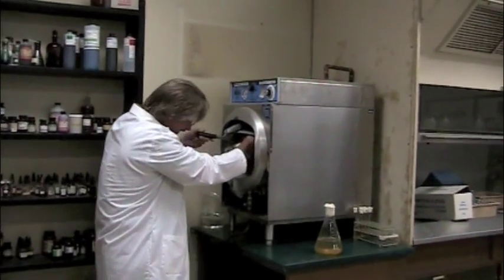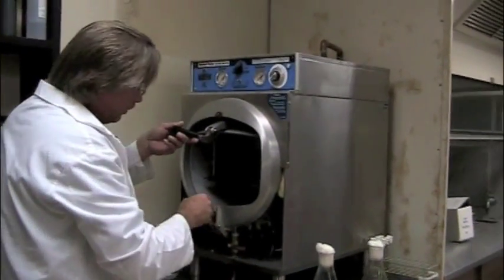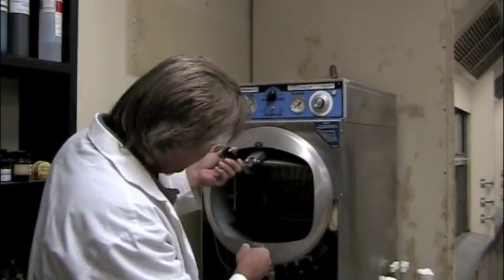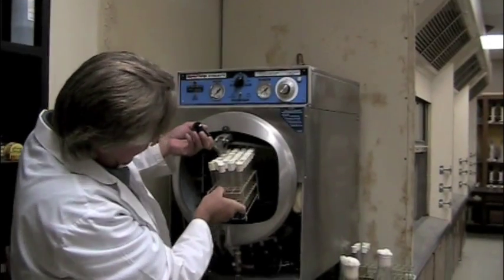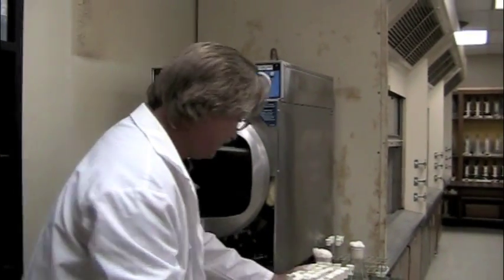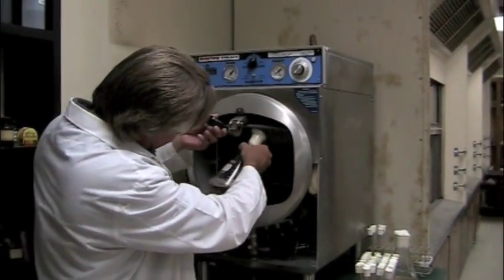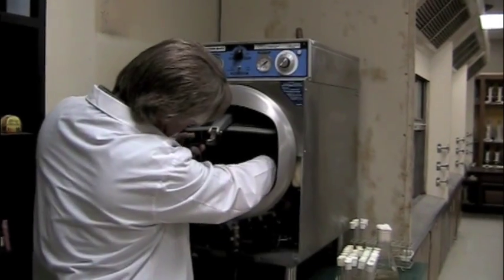We have a small autoclave at Western Texas College, and sometimes space is a matter — it's just a matter. I'm going to try putting the flask in. There we go.